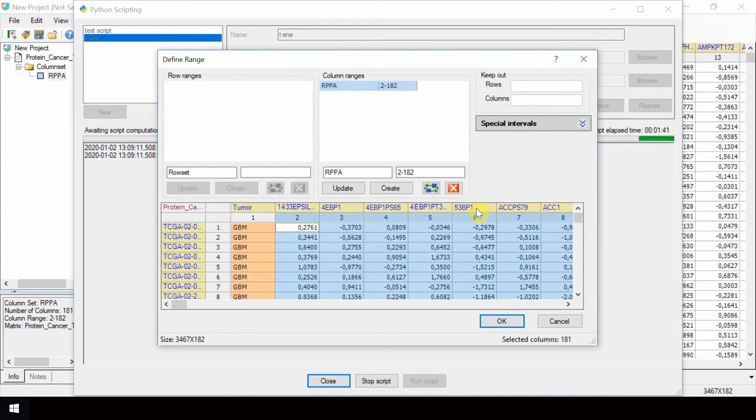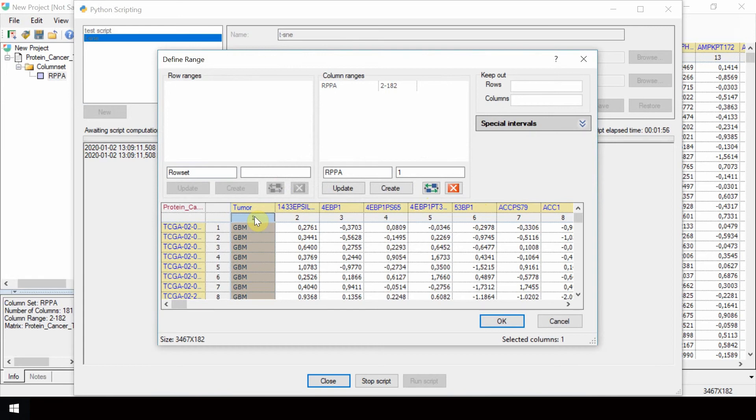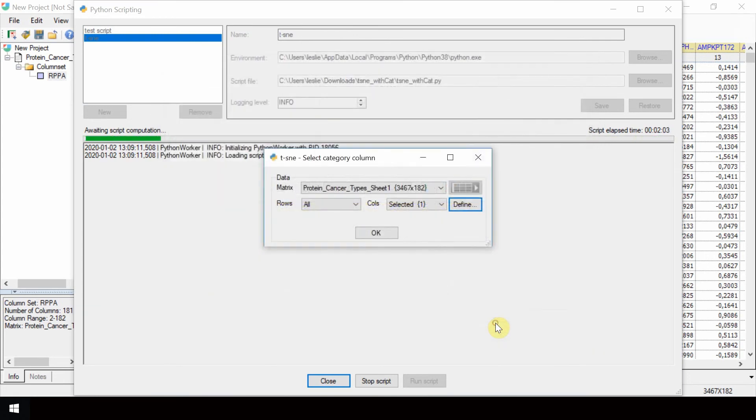In the Define Range window that appears, click on the column number 1 to select the column corresponding to the category variable containing the tumor types. Click OK to confirm the selection.